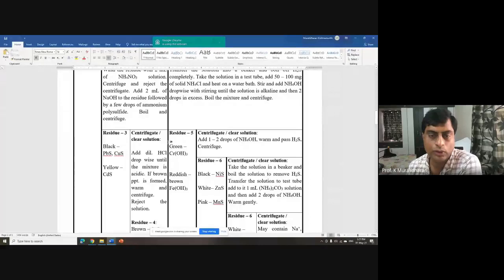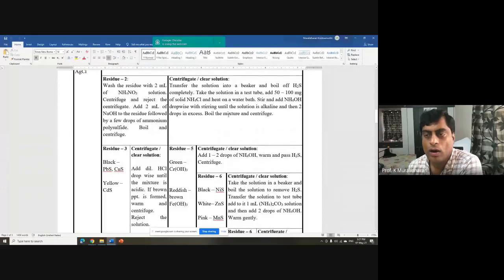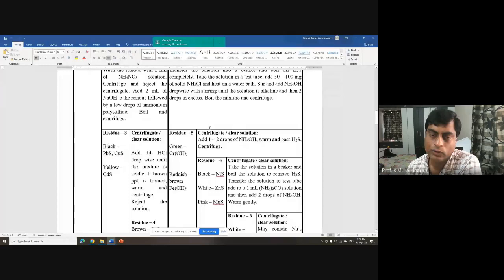Okay. So now, because you turned from acidic condition to basic condition, you are passing H2S one more time. You are adding a few more drops because you are getting precipitate here, right? So to complete the precipitation, you add a few more drops, centrifuge it and take the clear solution. If you are not getting precipitate, the same solution continues here. Okay. So if you get precipitate, you are centrifuging and separating it here.